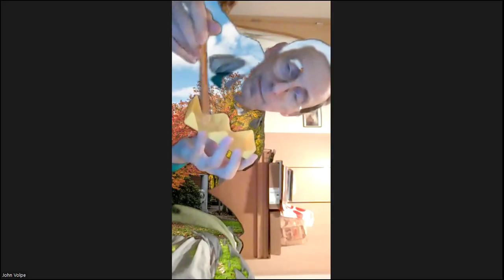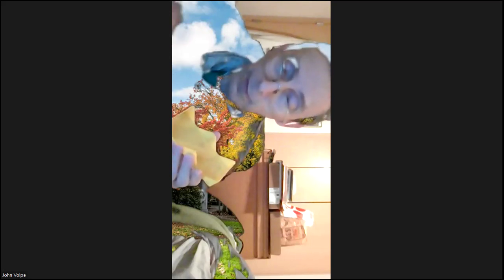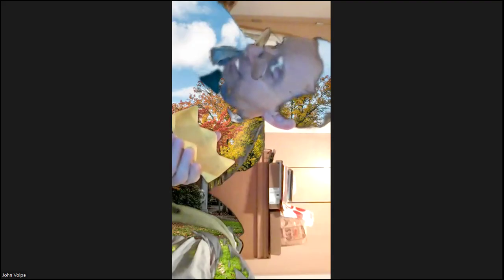Then when you're done, rotate the swab a quarter of a turn, rotate the disc another quarter of a turn, and do it at least 3 times, swabbing everywhere. Sometimes the procedure tells you to do it 4 times. Okay. And then when you're all done, take your swab and go around the edge of the disc so that you'll get bacteria growing along the edge. You do it along the edge because when you're swabbing, you might not swab all the way to the very edge. So you go around putting the bacteria on the edge of the plate. And now you should get a lawn of bacteria growth where the growth will grow everywhere. We call it a lawn because in a lawn, we have green grass everywhere. Any question about any of that?